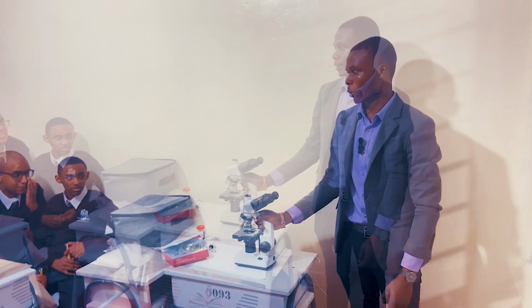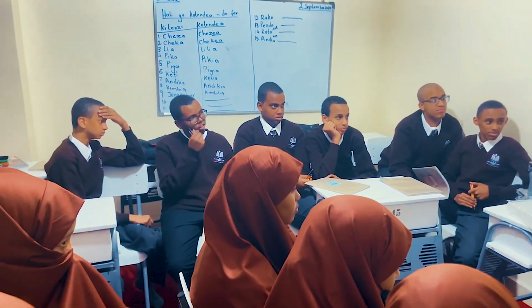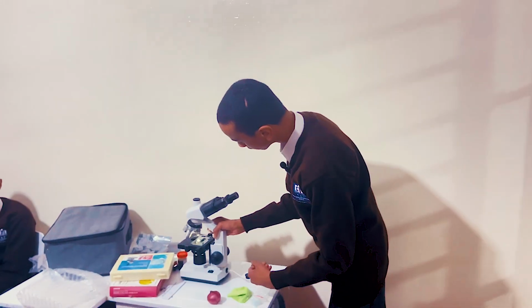Good afternoon, class. And we have a practical to do. A practical is about a microscope. We talked about two types of microscope, right? You can remind us. One, light microscope, good. Another one, yes, electron microscope.